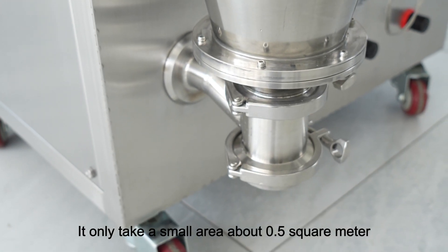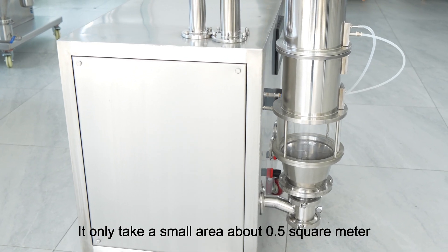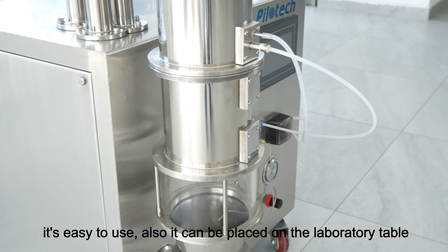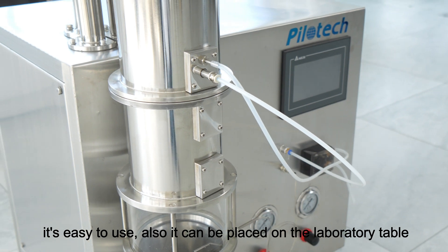It only takes a small area of about 0.5 square meters. It's easy to use and can be placed on the laboratory table.